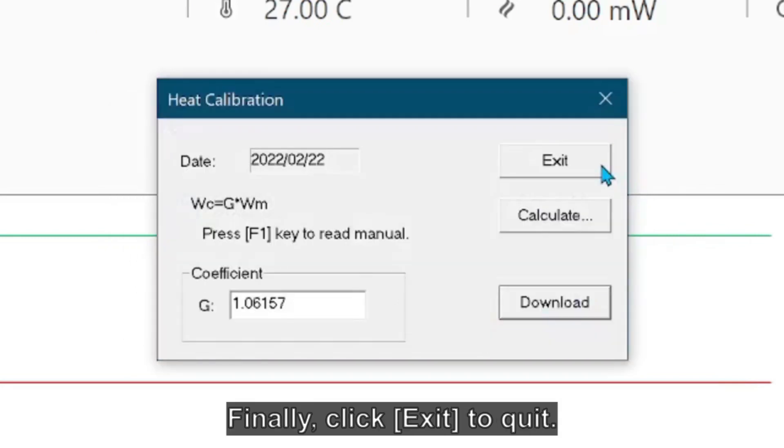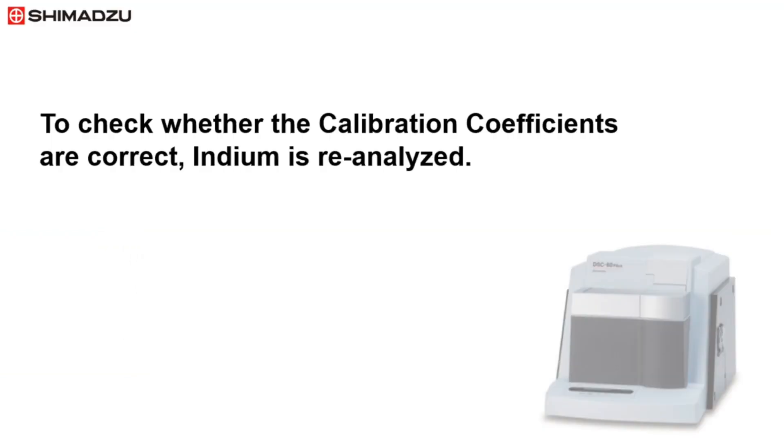Lastly, click Exit to quit. To check whether the calibration coefficients are calculated correctly, analyze indium again with DSC. Use the same measurement parameters as the first indium analysis.